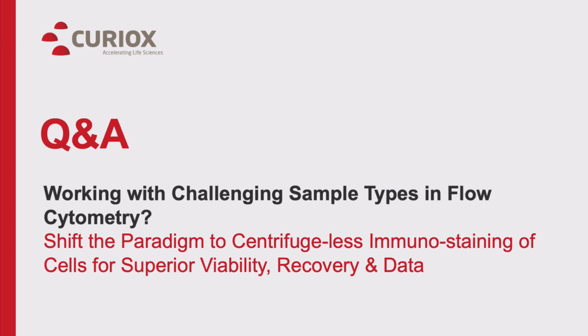Thank you. Can laminar wash apply to E. coli cells? Interesting question. We have not tried that yet, so I'm not really sure. I'm just hazarding a professional guess here that I would think you could probably use it for E. coli or bacterial cells, but it's something that we have not looked at either internally or our external collaborators have looked at either.